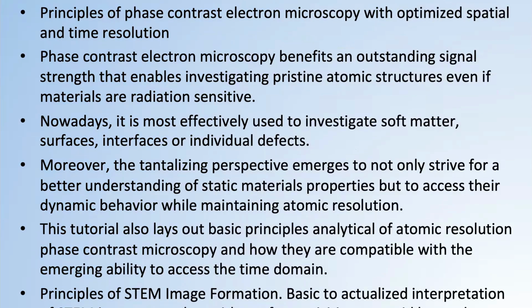So, if we want to expand a little bit more on the tutorial topics, we will say that there will be some principles of phase contrast electron microscopy with an optimized spatial and time resolution. That means high-resolution images or phase contrasts that benefit from an outstanding signal strength and that would enable us to investigate atomic structures that can even be sensitive to radiation.